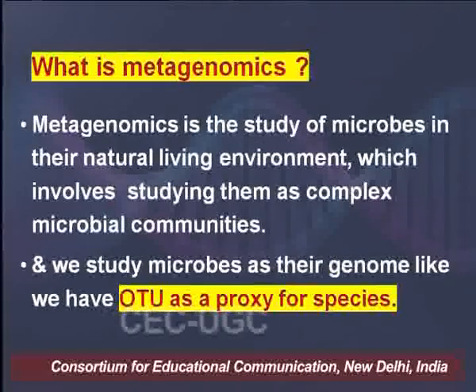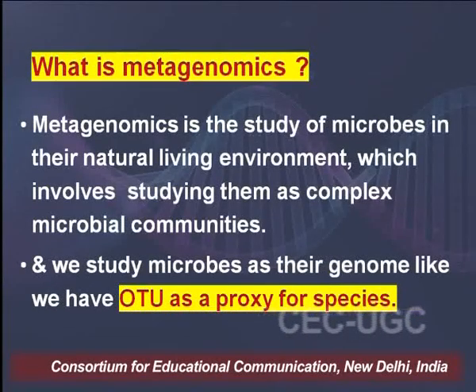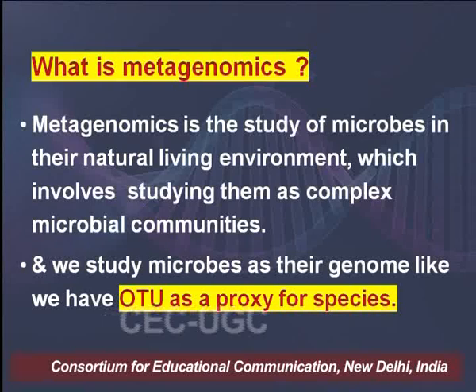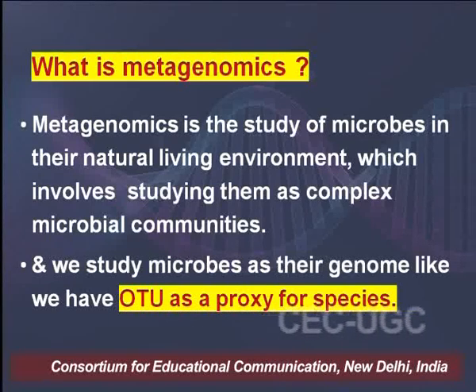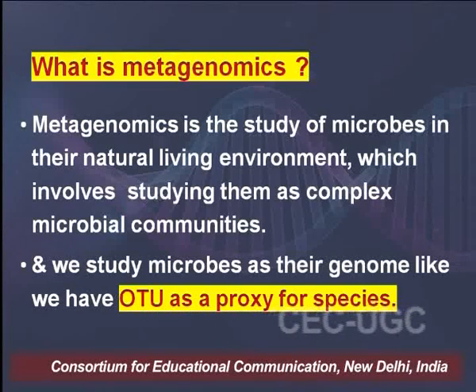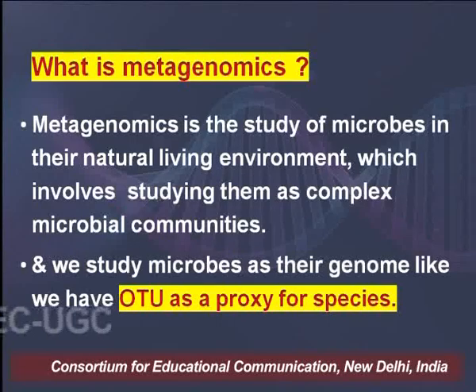So metagenome or metagenomics, as all of us know, is the study of microbes in their natural living environment, and this involves studying them as complex communities in their natural environment, because otherwise it has been very difficult to study them in their natural environment along with their interactions. And here we believe in one concept called OTU, operational taxonomic unit, and we consider that as a proxy of a species.